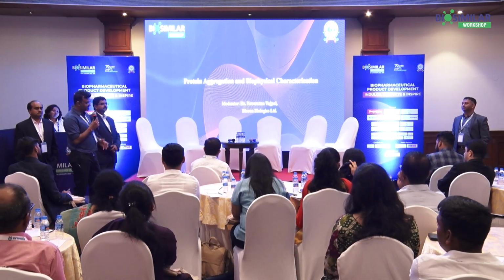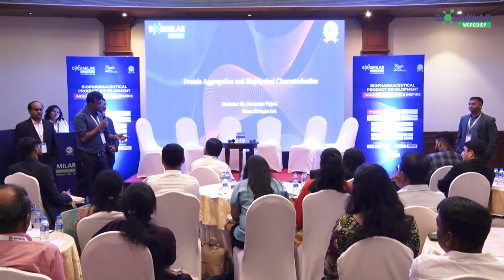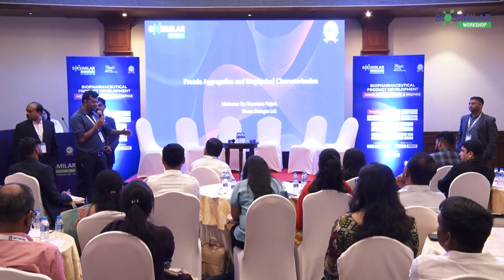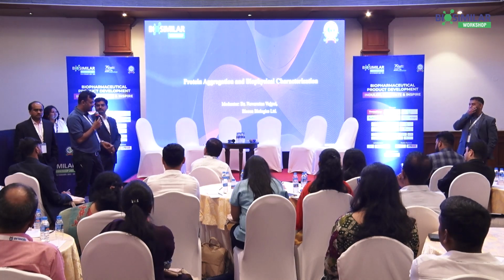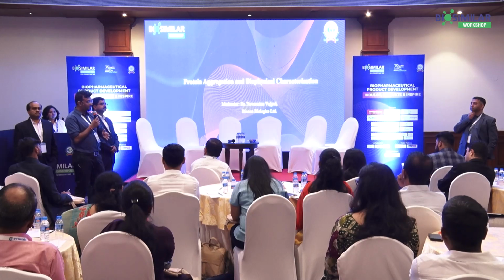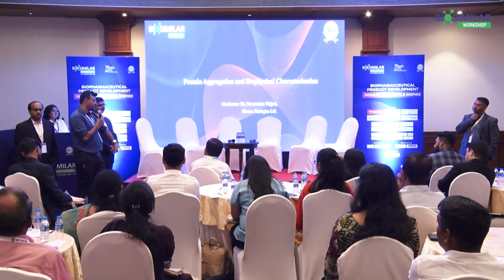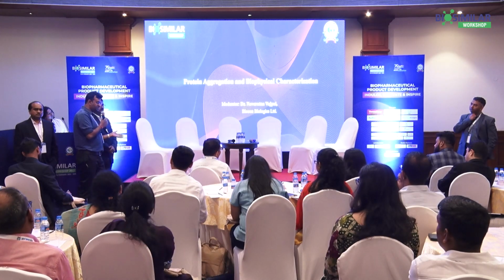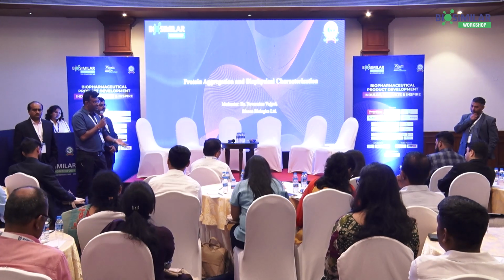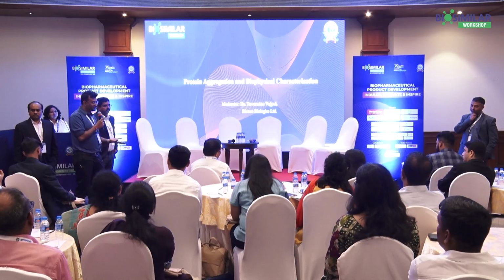We face this challenge in size exclusion chromatography as well for any aggregation pattern. You do a neat injection or you do a diluted injection, but then there are some tools to study. Like we are using a UPLC, you can do both. For the SEC, you can do a neat injection, you can do a diluted injection with various diluents and see the impact. But unfortunately in CD, there is a limitation of concentrations. Now, if you go to the tertiary structure determination using near-UV CD, that requires a higher concentration. That cannot be done at 0.1 and 0.2 mg per ml. That has to be typically done at more than 2-3 mg per ml. So both of them have their own limitations.